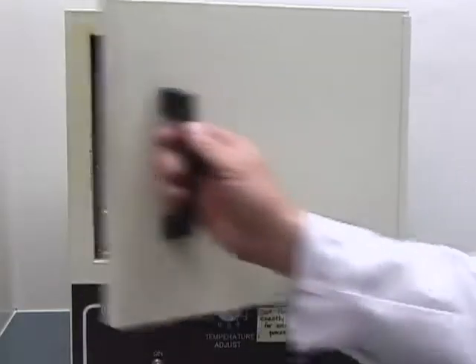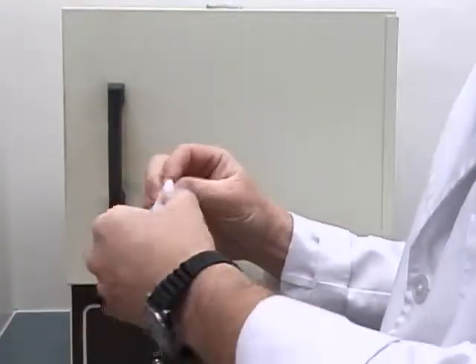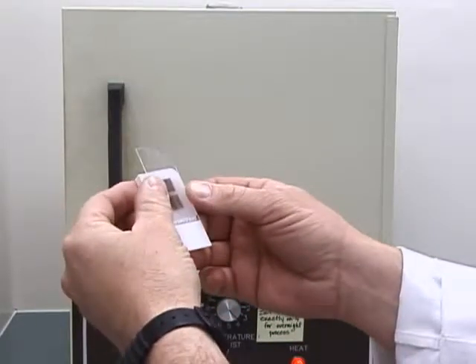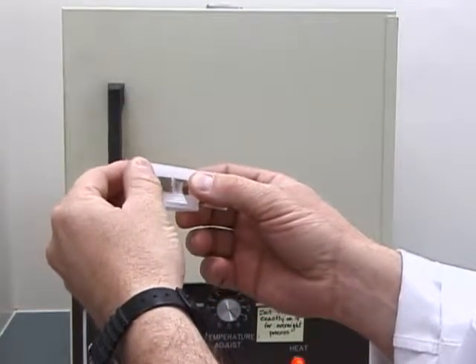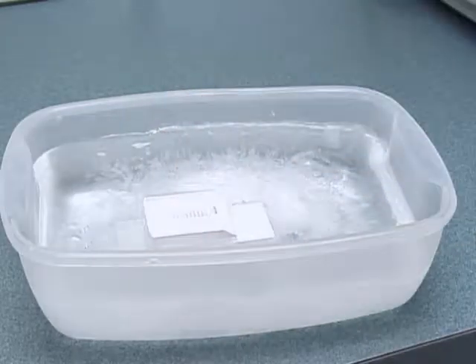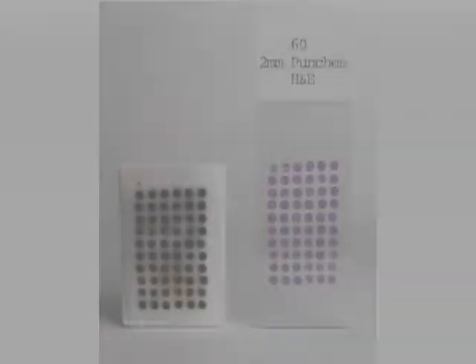After 15 minutes, remove the block and slide from the oven and press them together gently. This is what sets the punches. If you press too much, the punches will begin to spread out and make the rows warped and uneven. Place the block and slide together on a piece of ice. Don't separate them until the block is cool.